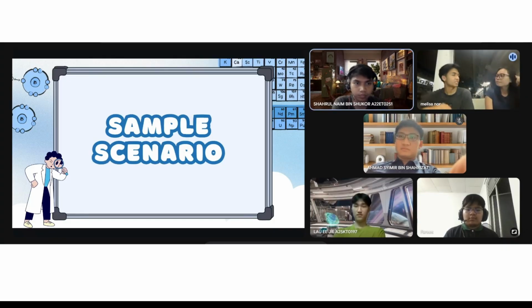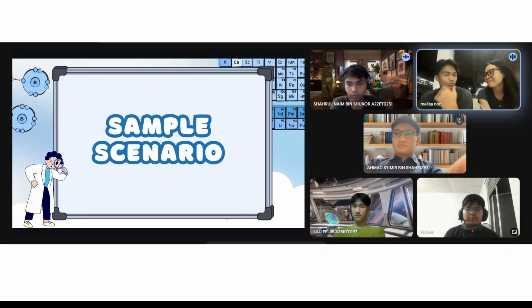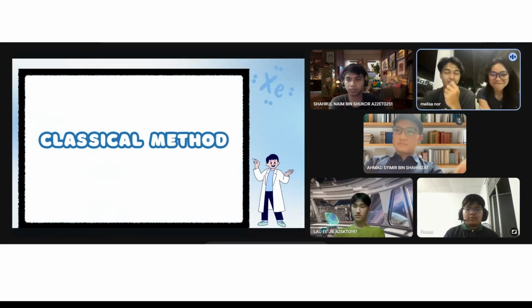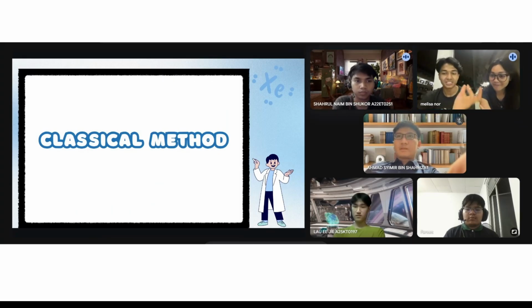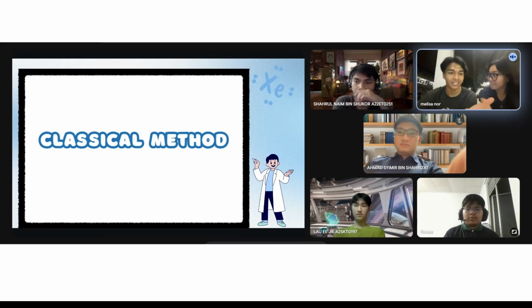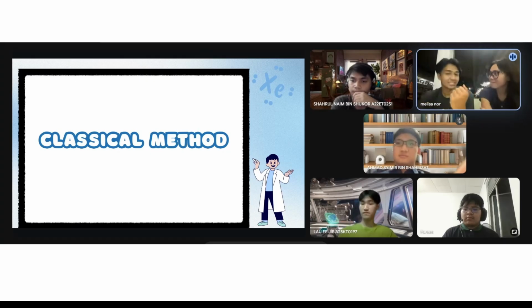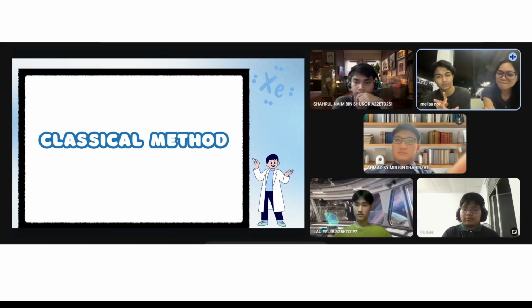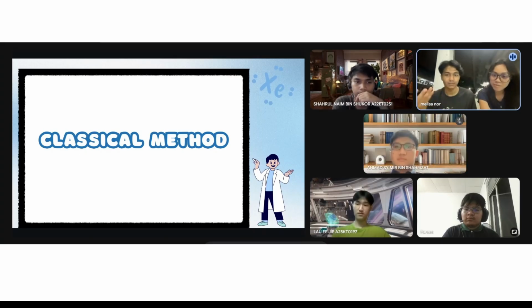Thanks, Melissa. That's a very good explanation. So there's one traditional method used to determine glucose concentration, which is the Benedict test. Benedict test is a colorimetric chemical analysis. The sample is mixed with Benedict's reagent, which contains copper(II) sulfate, sodium carbonate, and also sodium citrate.